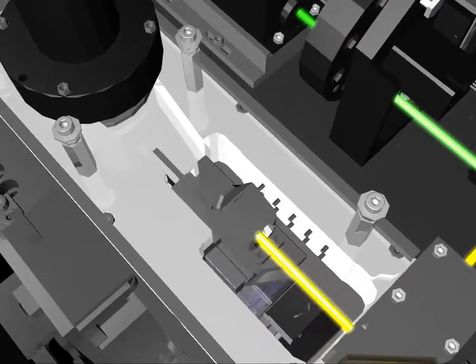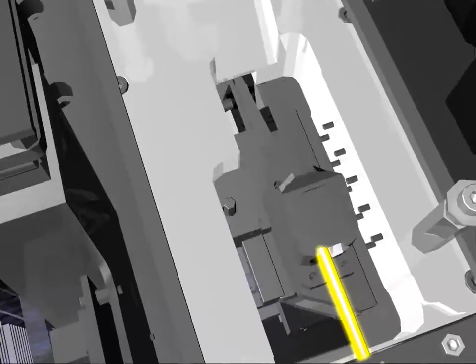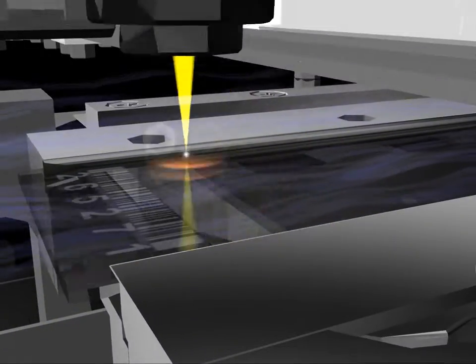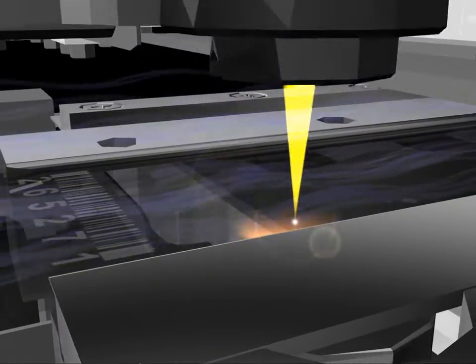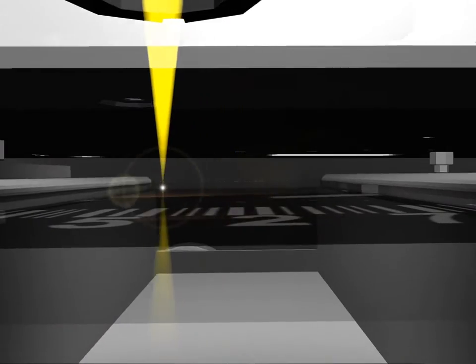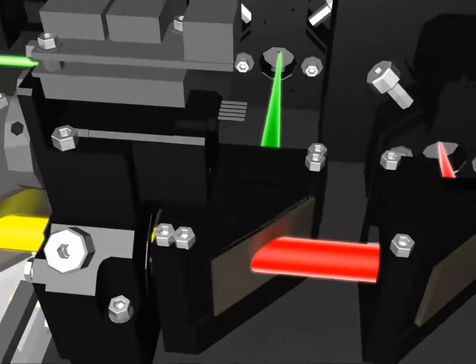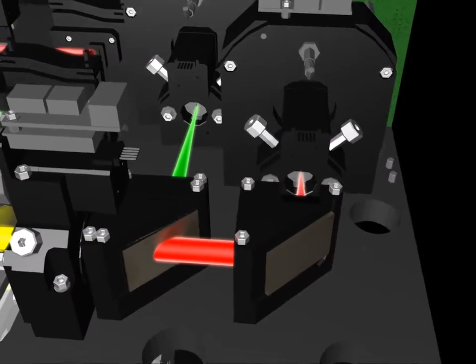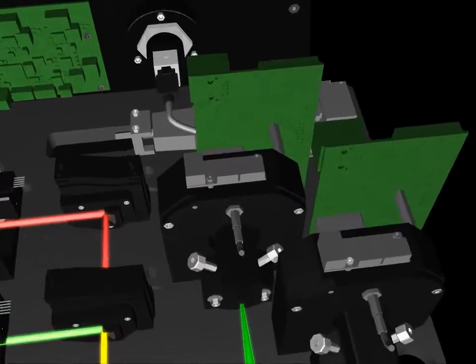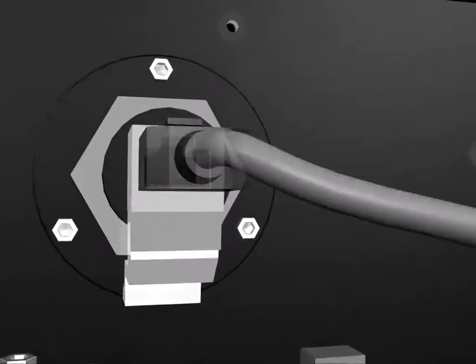The MS200 meets the highest standards of flexibility, precision and safety. Its open platform provides an integrated microarray workflow solution that is upgradable, ensuring compatibility with NimbleGen high-density arrays of today and ultra-high-density arrays of tomorrow.